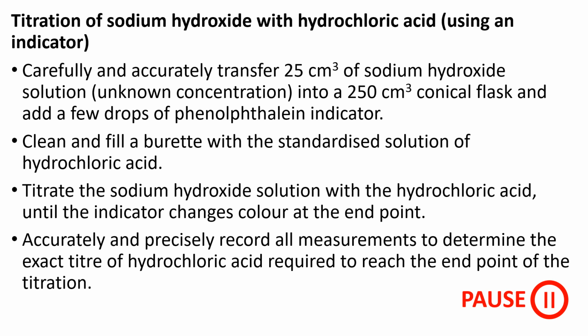Here is an example of a procedure that could be used. In this case, the hydrochloric acid is the same solution that you standardised in the previous practical, so you will know its concentration. Pause the video and read the procedure carefully.